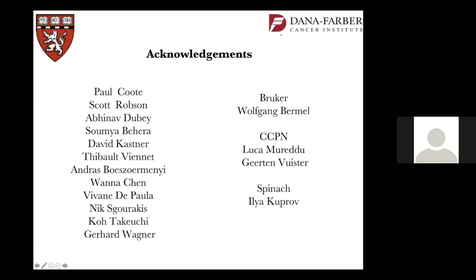Thank you, Hari. That was an excellent talk. I don't see any questions, but I had a question related to your pyruvate work. These peak shapes that you get of the non-coupled and residual coupled line shapes, will they be different with different strains of E. coli that you might use? And could this method be used, say, with yeast?